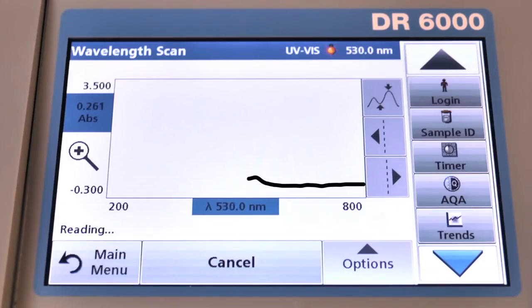Also, high-speed wavelength scanning across UV and visible wavelengths allows you to develop and save your own custom methods for your specific parameters of interest, so they can be easily repeated.